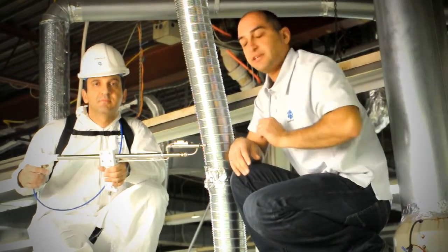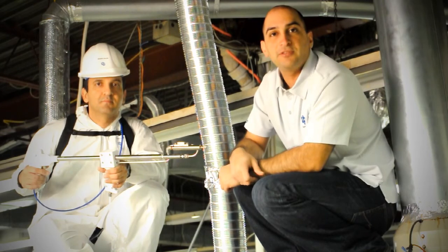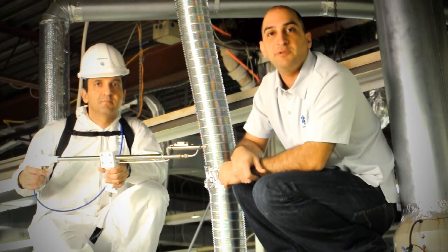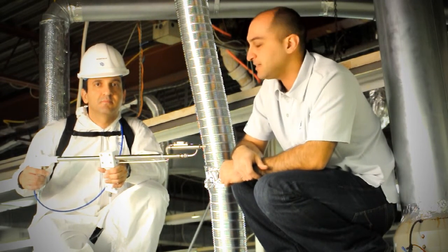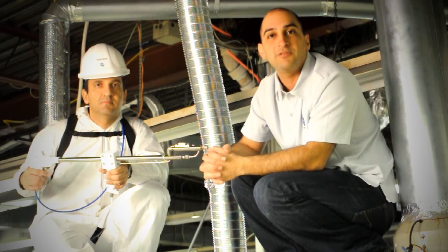If you have a stack like the one here, it's a bit hot. If there's hot air going through it and you want to take a sample directly, the sample is going to condense within the bag. And the condensation is going to take out lots of the odors that you're trying to measure.